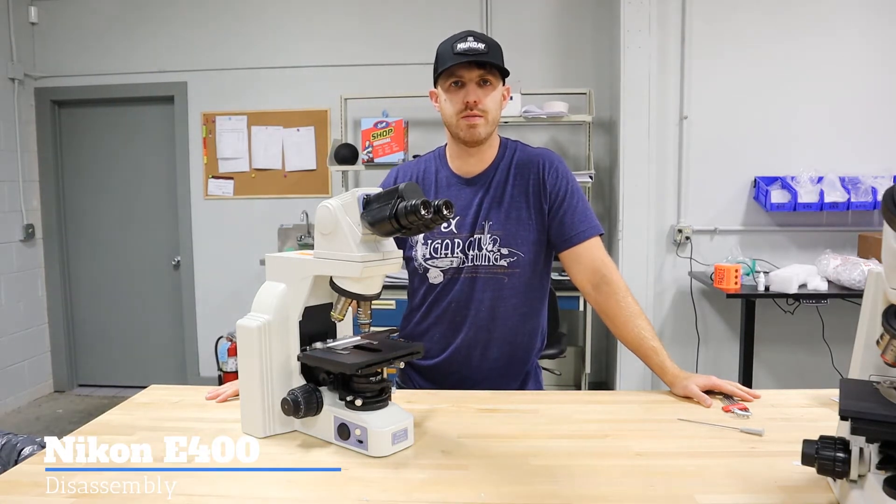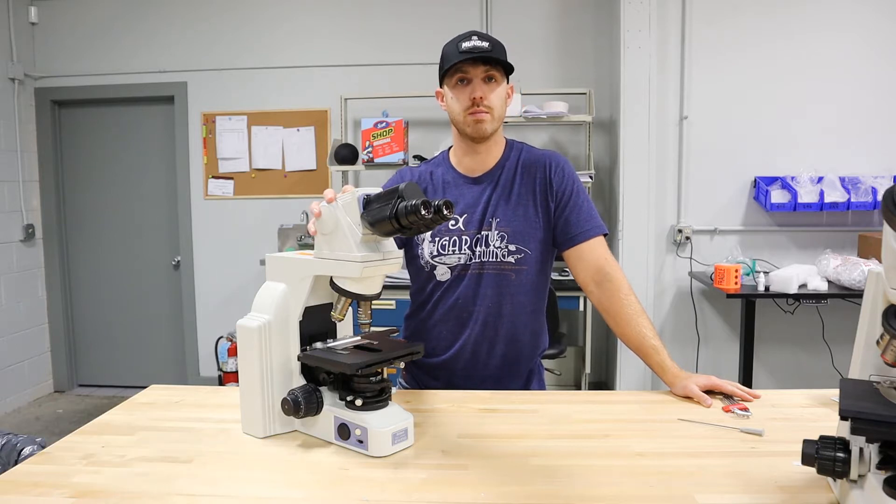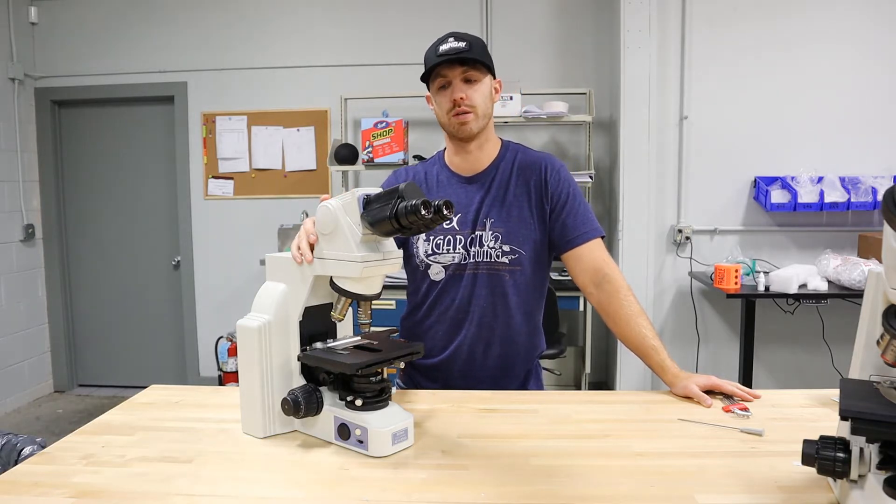Hey, this is Chad with Monday Scientific. Today we're going to show you the assembly, disassembly, and reassembly of a Nikon E400 microscope.